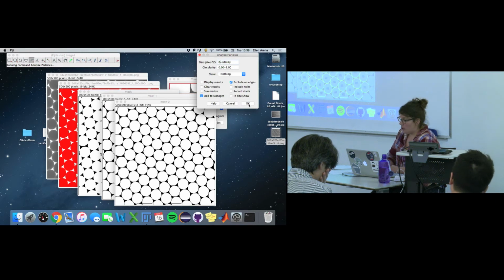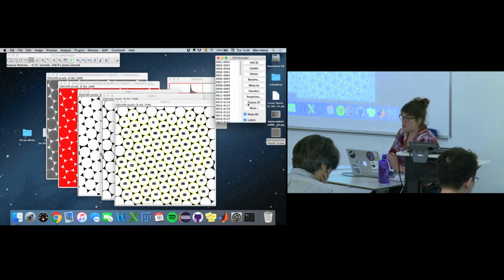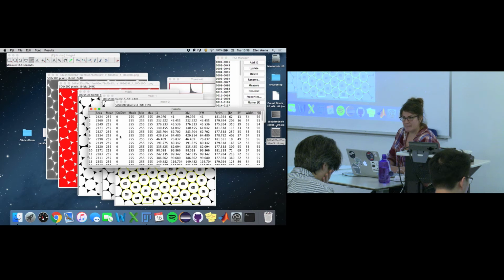And actually the overlay, if you have the show all button and the label selected, it actually tells you how many objects there are, 75. But then again, you can always just deselect and measure. And it's fine, we're doing it on the mask now, because all they cared about was counting these objects. So we see we have 75 objects. Okay? So that's one method of how to actually count objects.